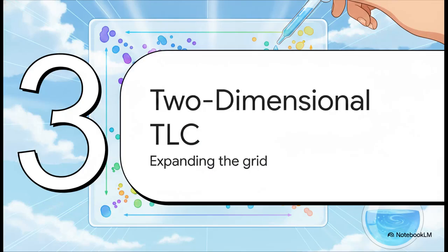Section 3. Two-dimensional TLC, expanding the analytical grid.